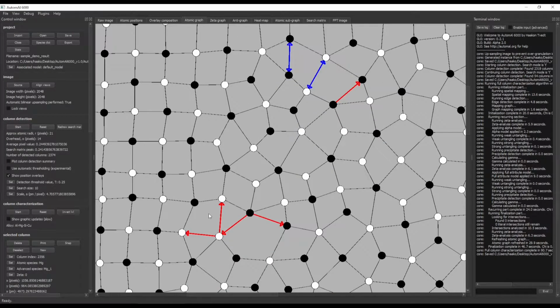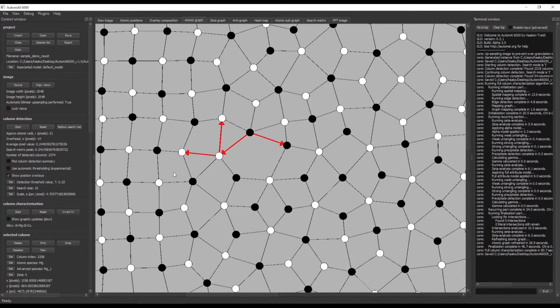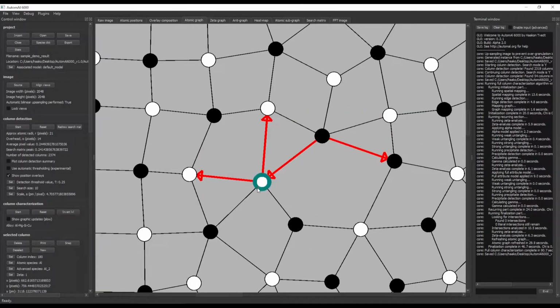If we now move on to the problem area here, we want to see what is wrong. First of all, this is pointing to a same plane neighbor, which is wrong. But we can see how many extending arcs there are. There is one here because of the symmetric arc. You remember it goes both ways. So we had one arc extending out here. There is one arc extending out there, and it has one there and one there. So this has 4 arcs extending out from it.